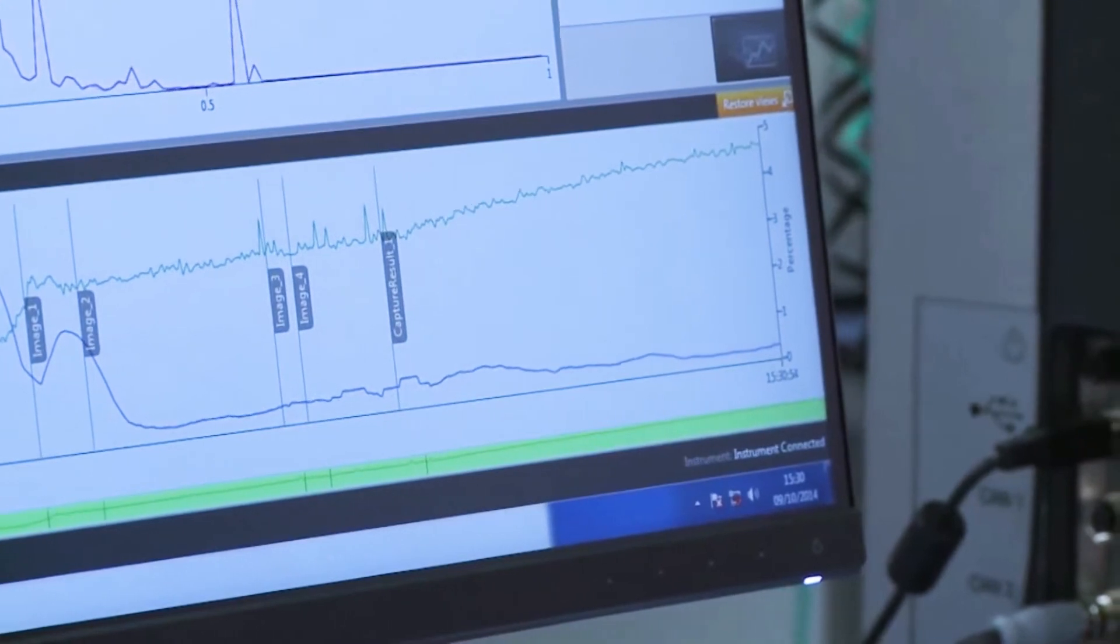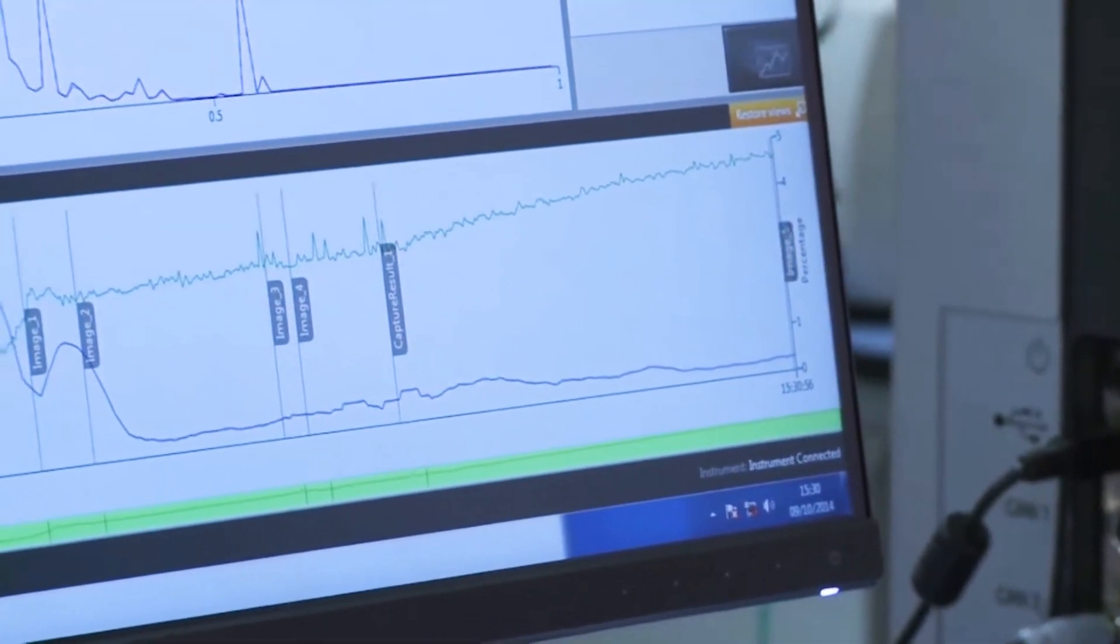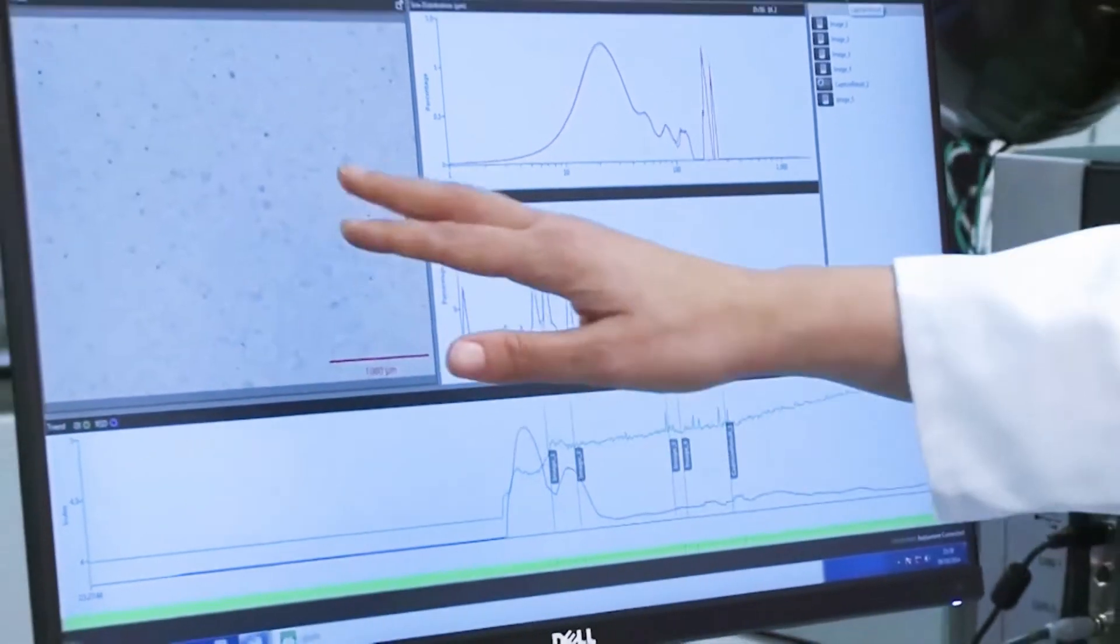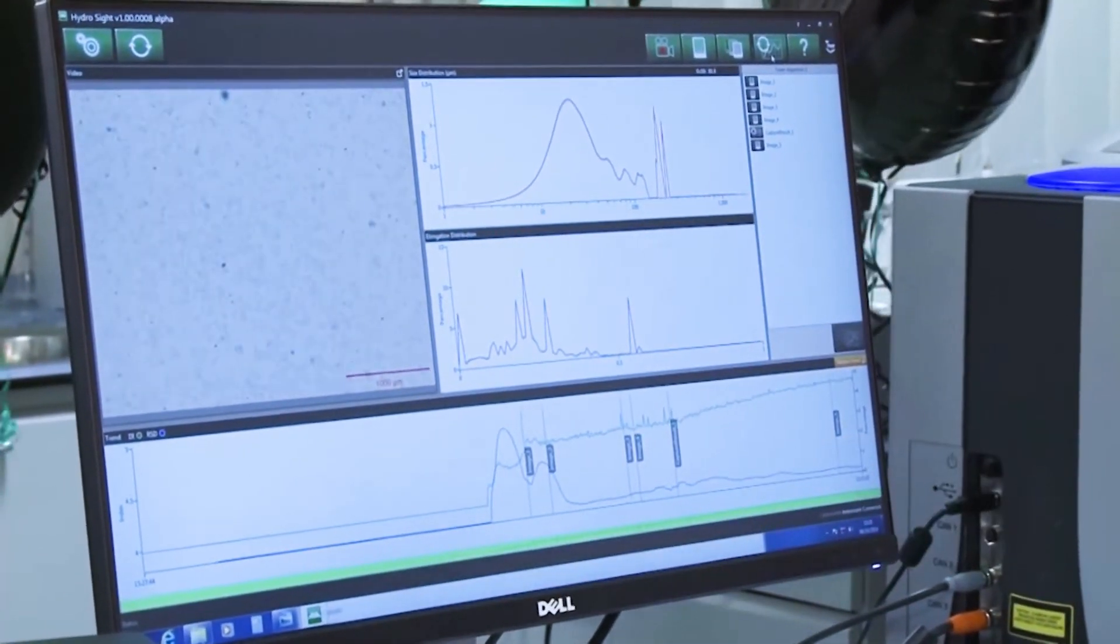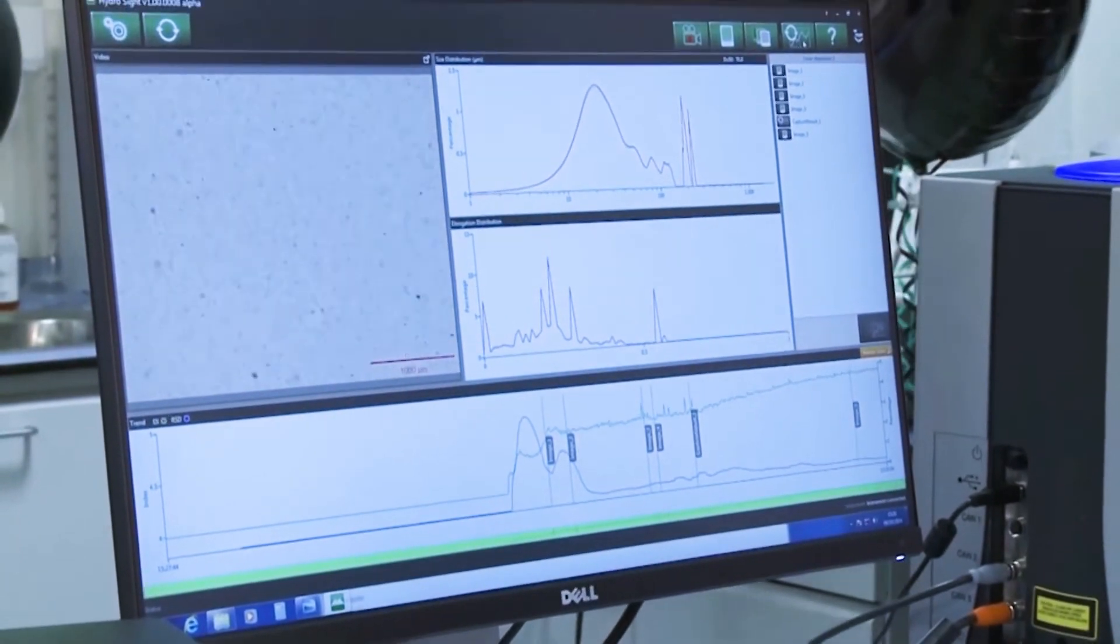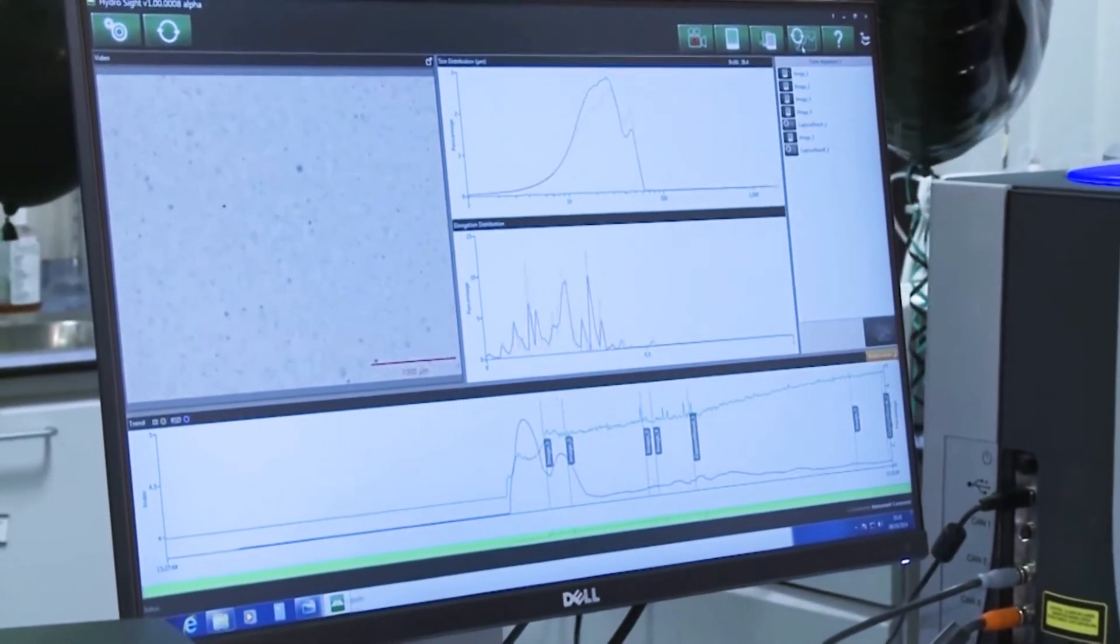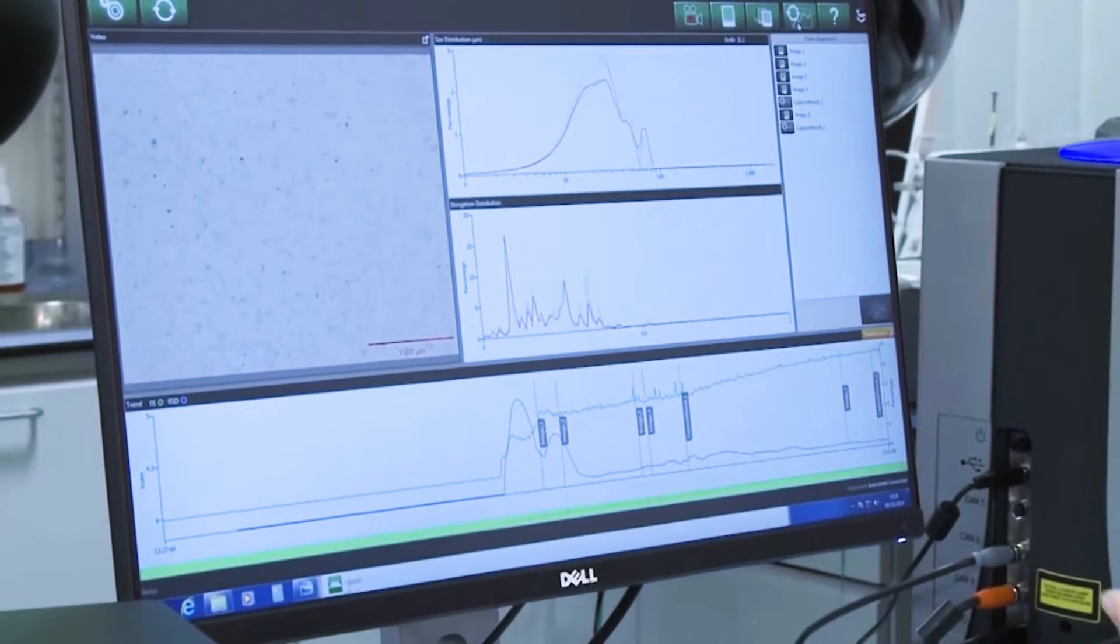What I can do is capture images. And when I do that, that takes an image of all of the graphs and of the live view and it puts an event into our dispersion index chart. I can also reset those graphs by pressing on the reset chart.